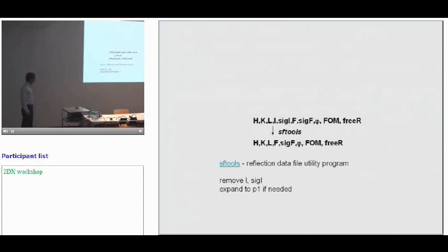In some cases, it may also be useful to expand from your symmetry to P1. We discussed that yesterday: this is of course not calculating the structure in P1. This is expanding a symmetrized data set into P1 in order to be able to calculate a whole unit cell with symmetry.